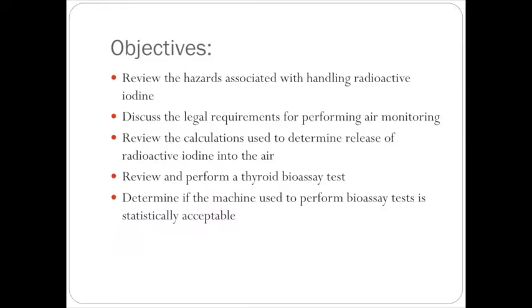So objectives, we're going to talk about hazards of radioactive iodine. We didn't spend a ton of time on radioactive iodine, so I'll touch on a few of those things here. We'll talk a little bit about why we do air monitoring and what the requirements are for doing air monitoring. I have on here review the calculations. Since we're not going to spend a lot of time with this, we'll talk a little bit about how you would do it and what kind of information you need, but I'm not going to make you do any type of calculations.